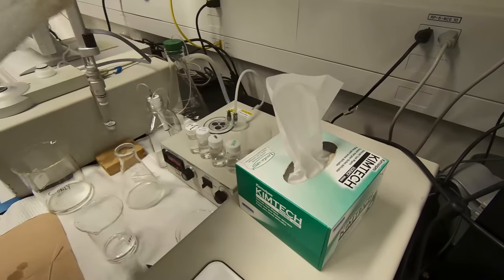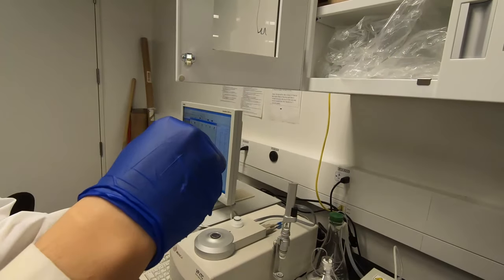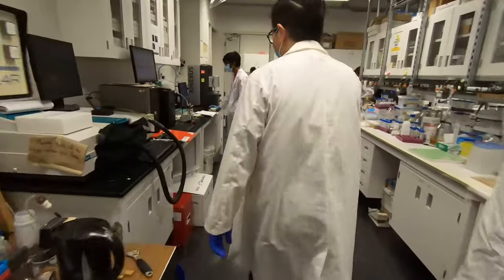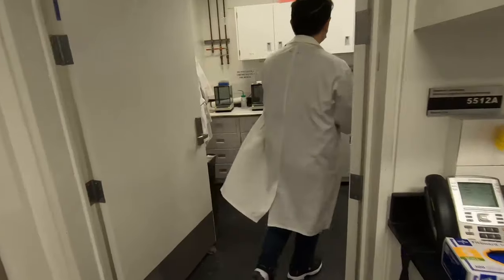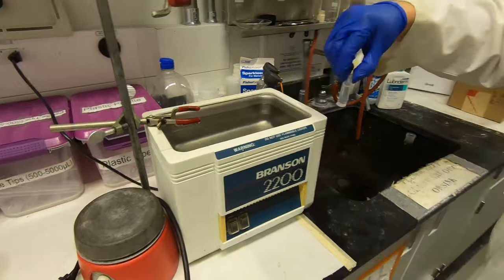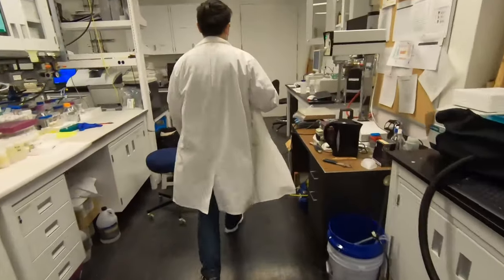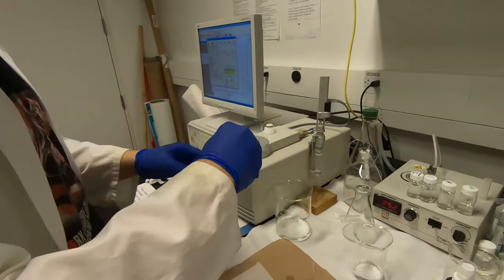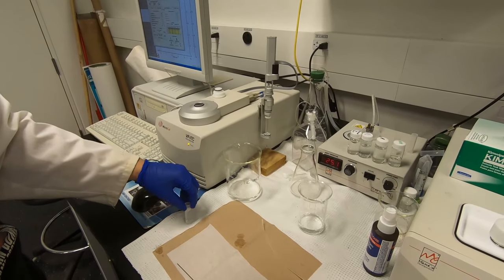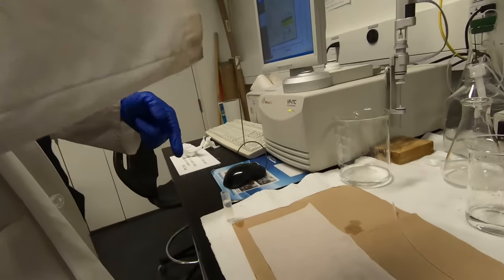After five minutes, you may see small air bubbles inside — that's okay. What I do is use sonication to get rid of the air bubbles. Just use sonication to remove them. After that, this is your sample — you have already degassed it and cleared the air bubbles. Put it somewhere flat and use the needle to draw your sample into the sample cell.